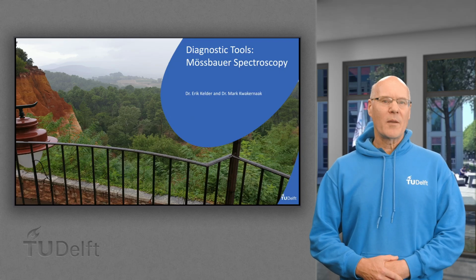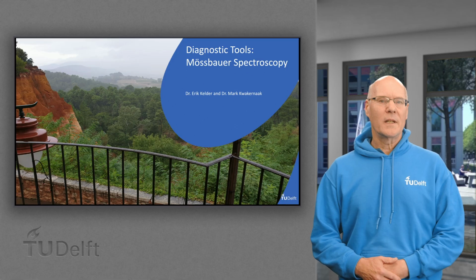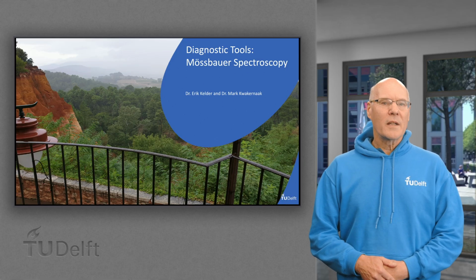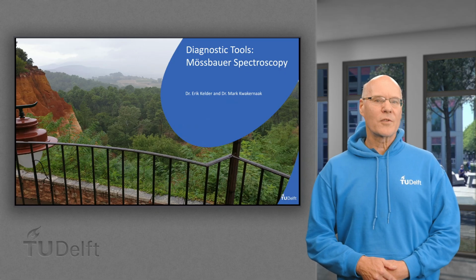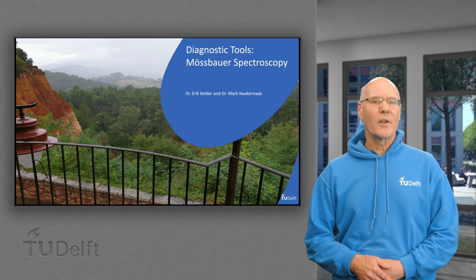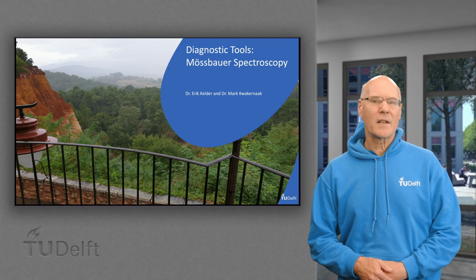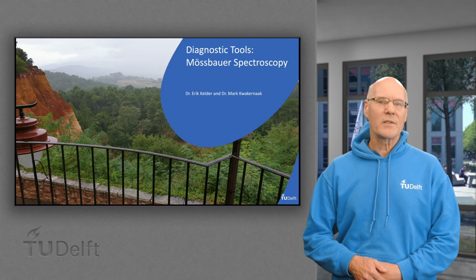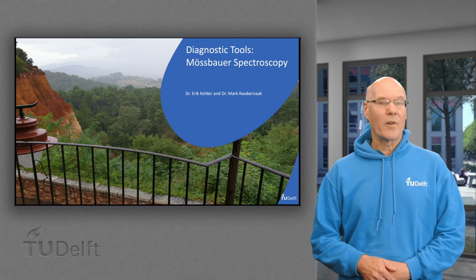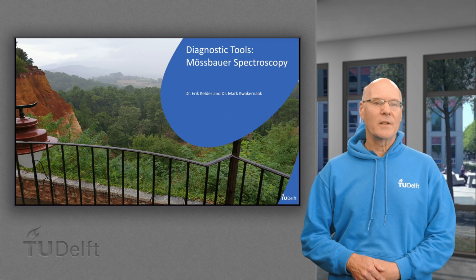Before materials can be used in the battery, they need to be analyzed on quality, ex situ, in situ or operando. The method we describe here concerns Mössbauer spectroscopy, which is a method not so well known and not so often used. This is because it analyzes only several elements in terms of oxidation state and environment, providing information on performance and stability during operation.